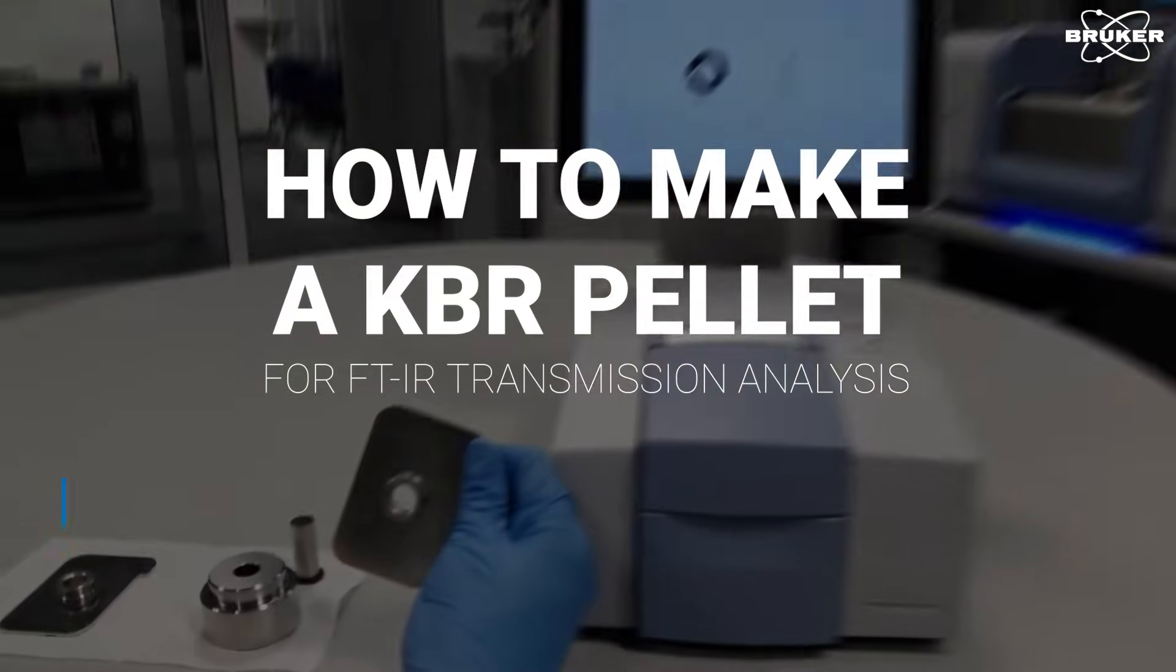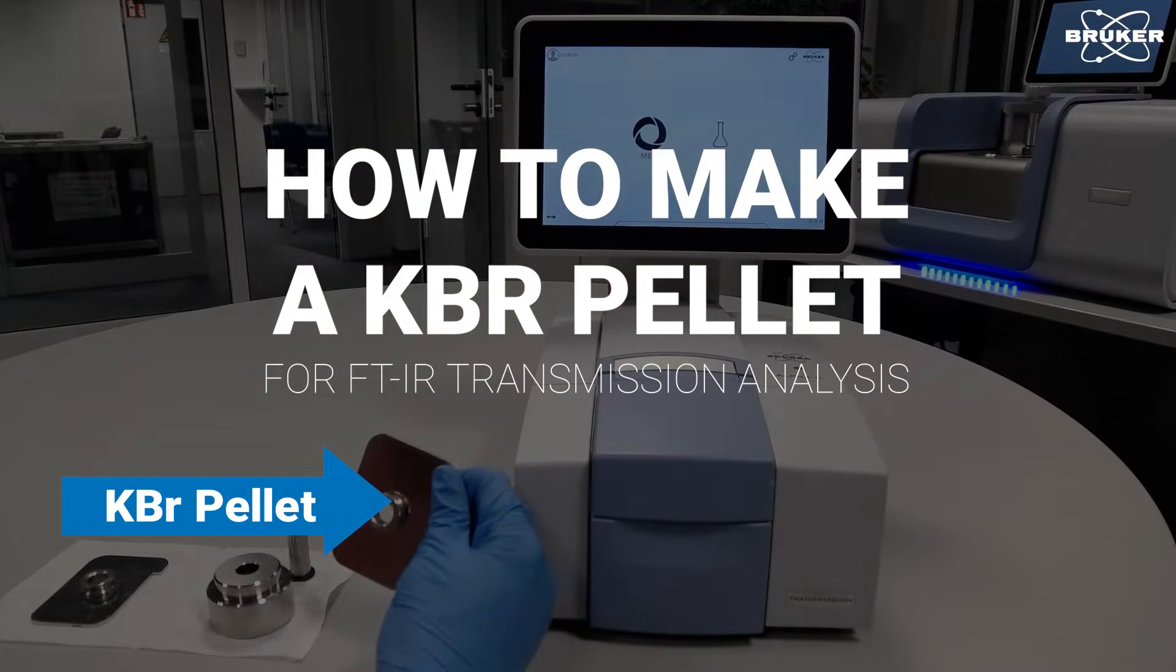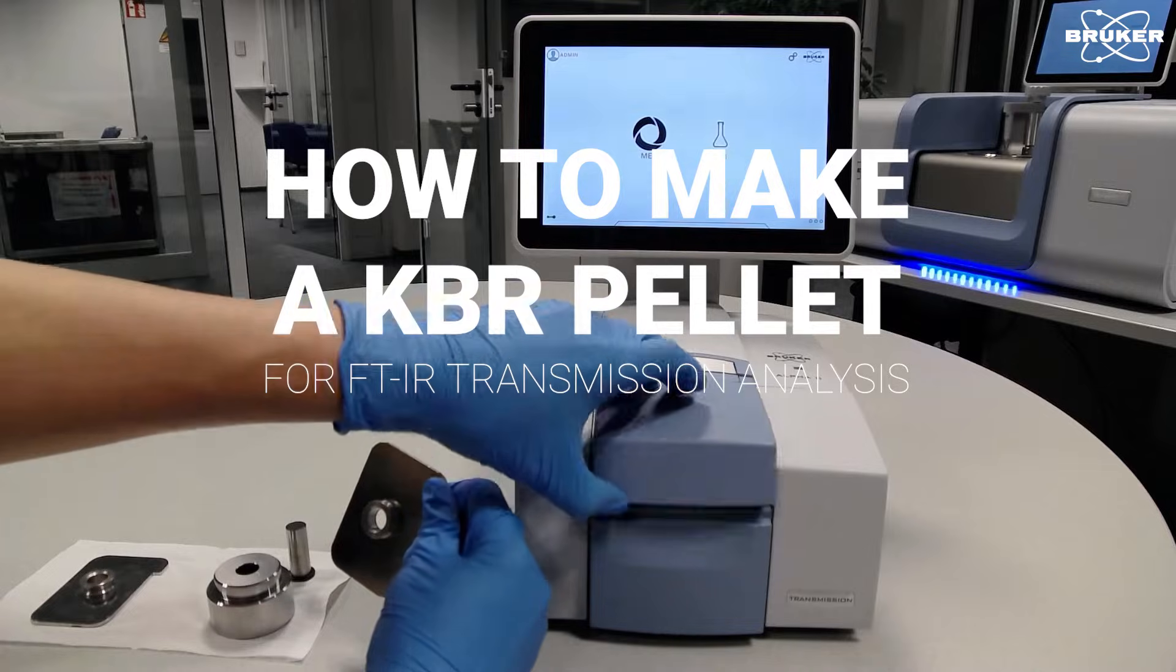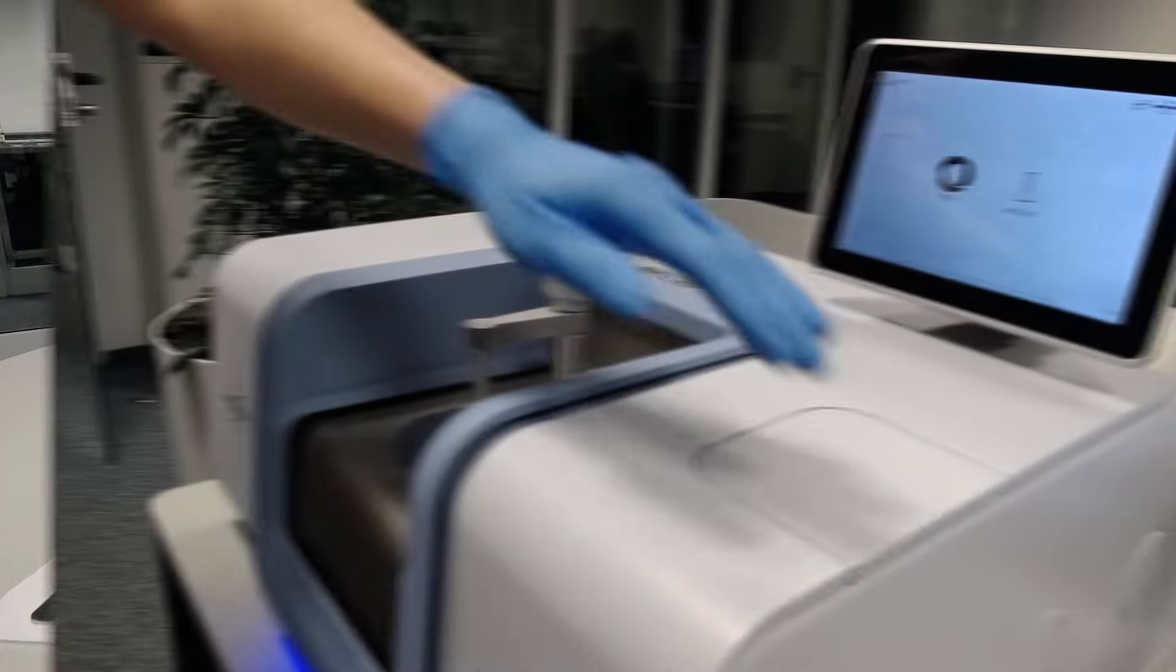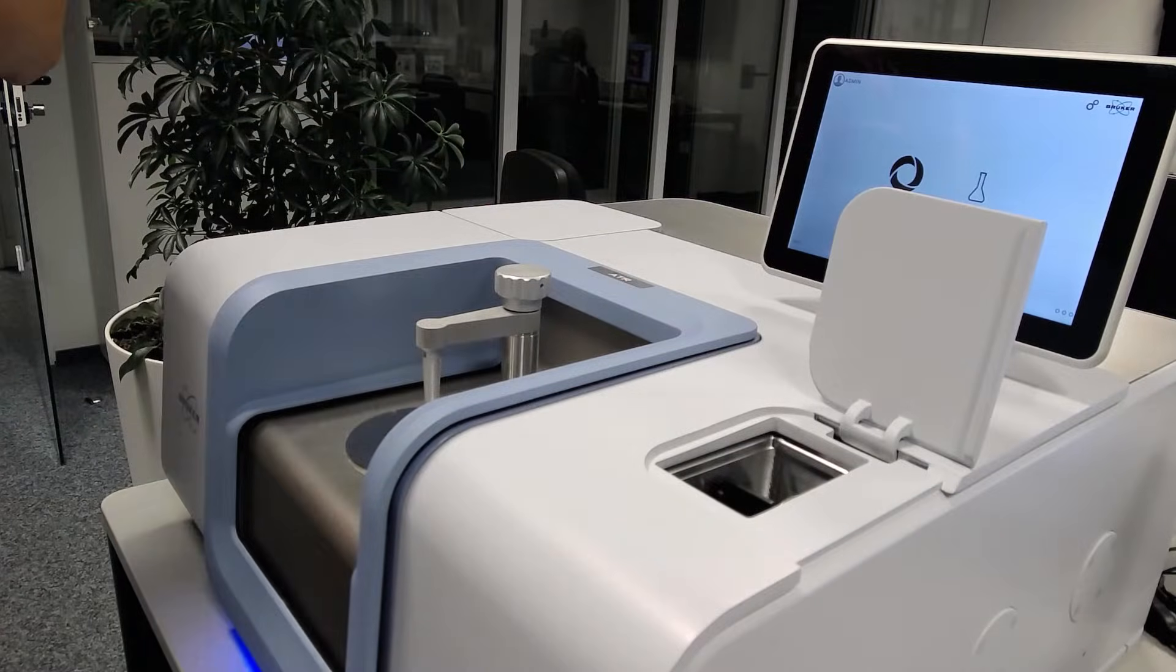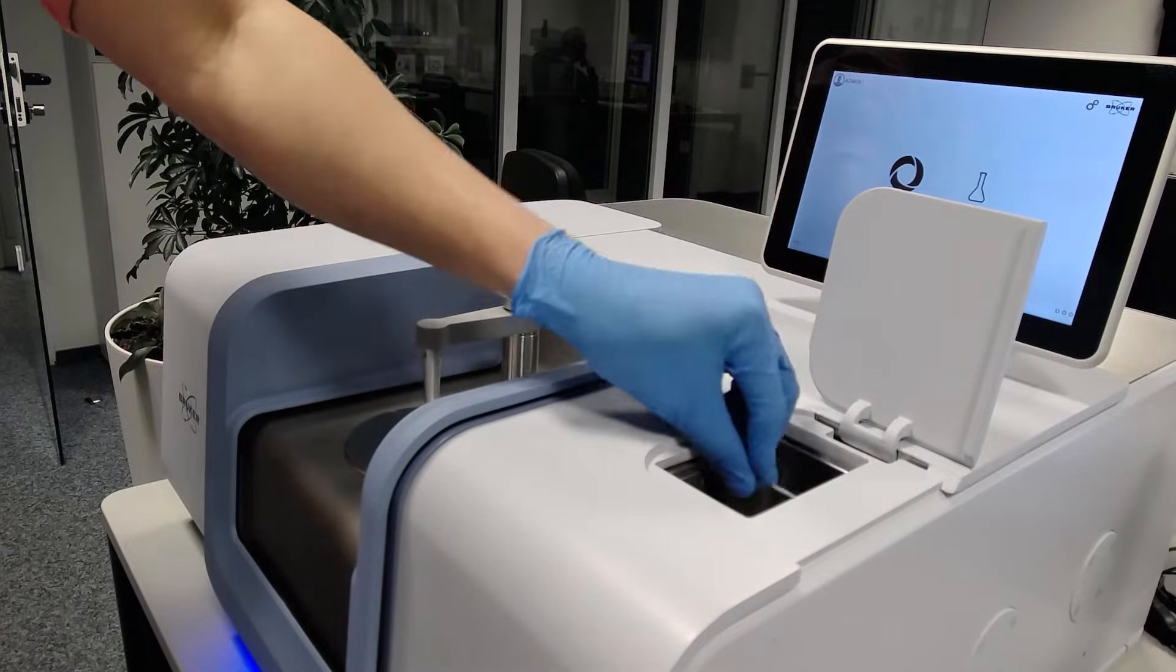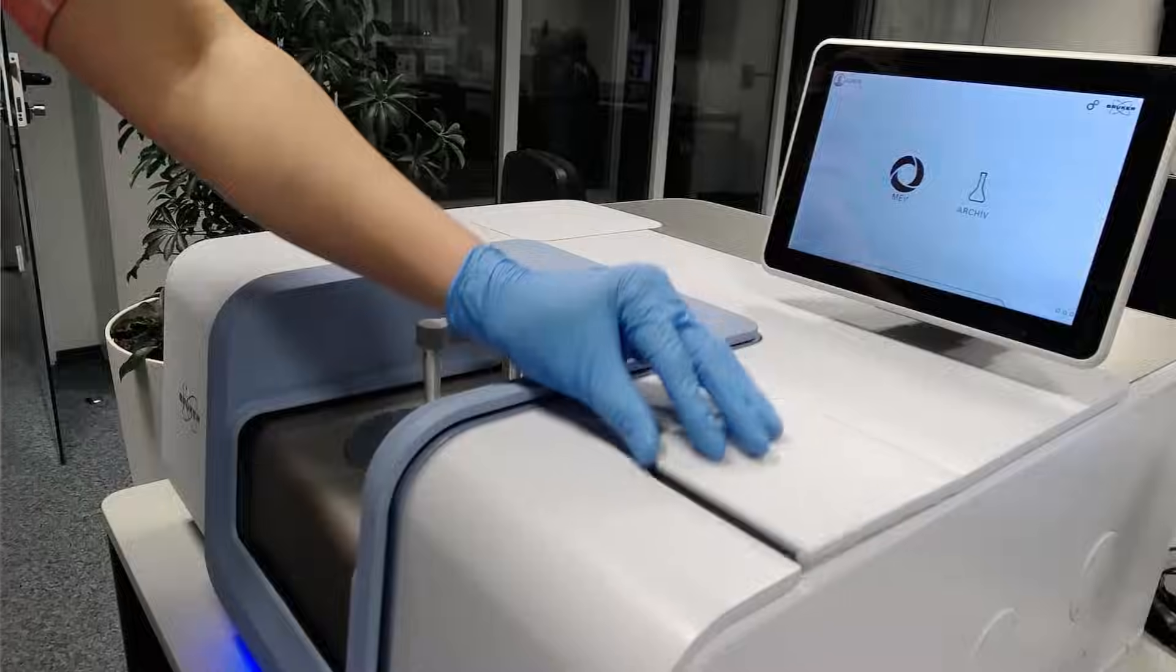How to make a KBR pellet. To this day, KBR pellets are commonly used in FTIR transmission analysis. In this video we show you how to make a KBR pellet and here's what we need to make it.